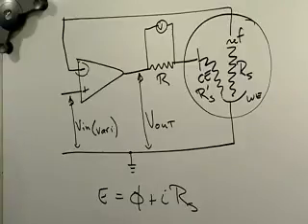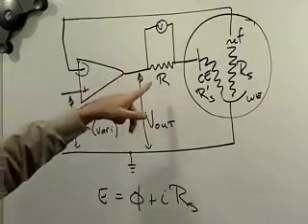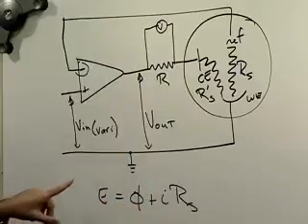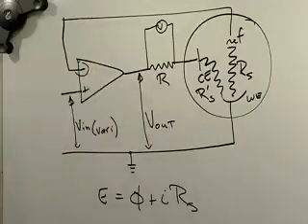But then that would cause the temperature to drop, a tenth of a degree or something like that, and so that would tell the furnace to turn on, and then it would get up to temperature almost instantaneously because it's only a tenth away, and so it would turn off, and you start getting oscillation. It turns out that is an ever-growing oscillation. It just does the opposite of damping out, right? It goes into uncontrolled oscillations, a parasitic oscillation. So you have exactly the same problem here, and you are depending on the fact that there is a little IR drop to make sure that the actual potential that you want and the actual potential that this amplifier is seeing are slightly different so that you don't go into this oscillation.